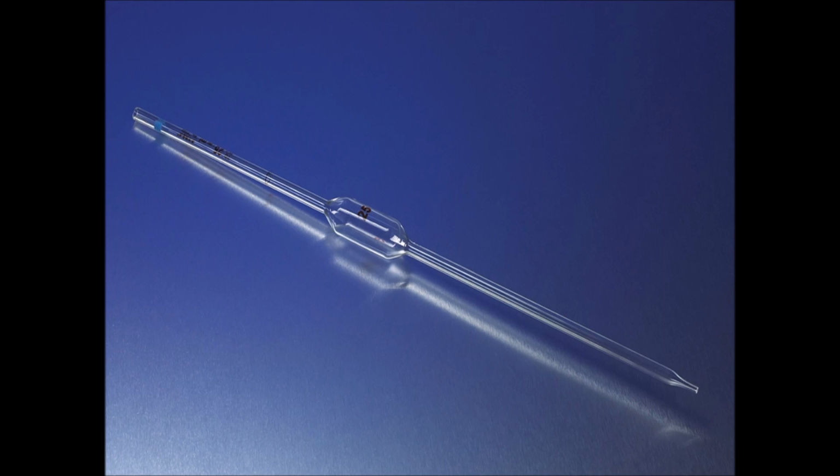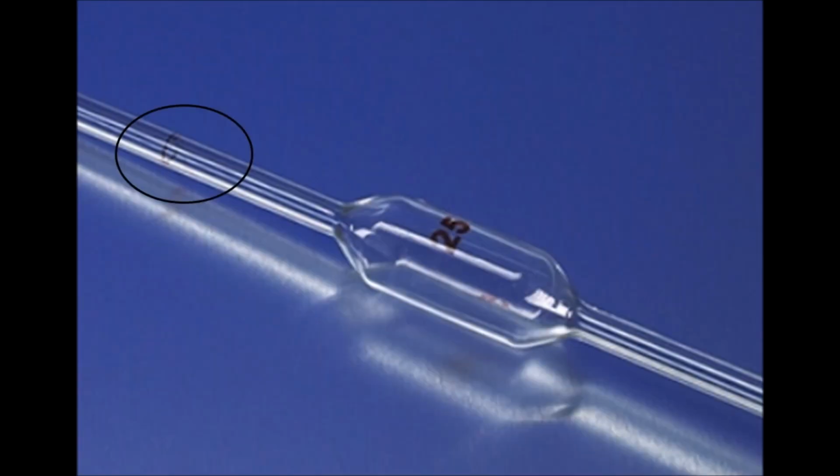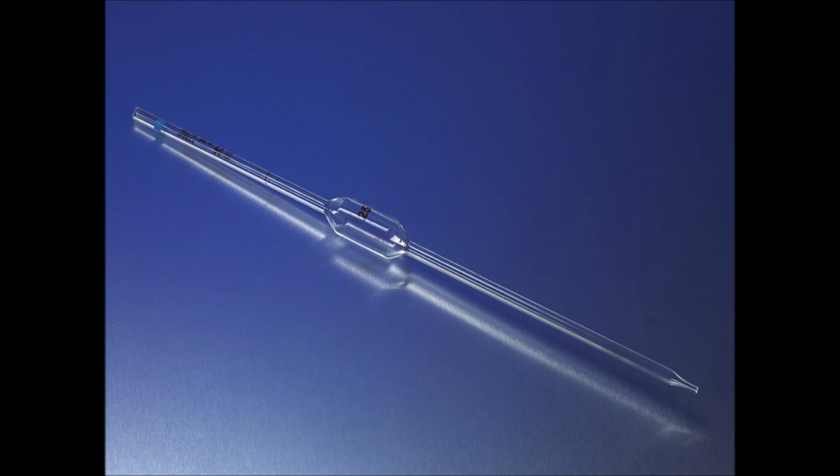This short video will show you the correct procedure for using a pipette. Here you can see a volumetric or bulb pipette which allows you to accurately deliver a fixed volume of liquid. If we zoom in, you can see the calibration mark on the top section of the pipette, which is the point you should fill the pipette to.